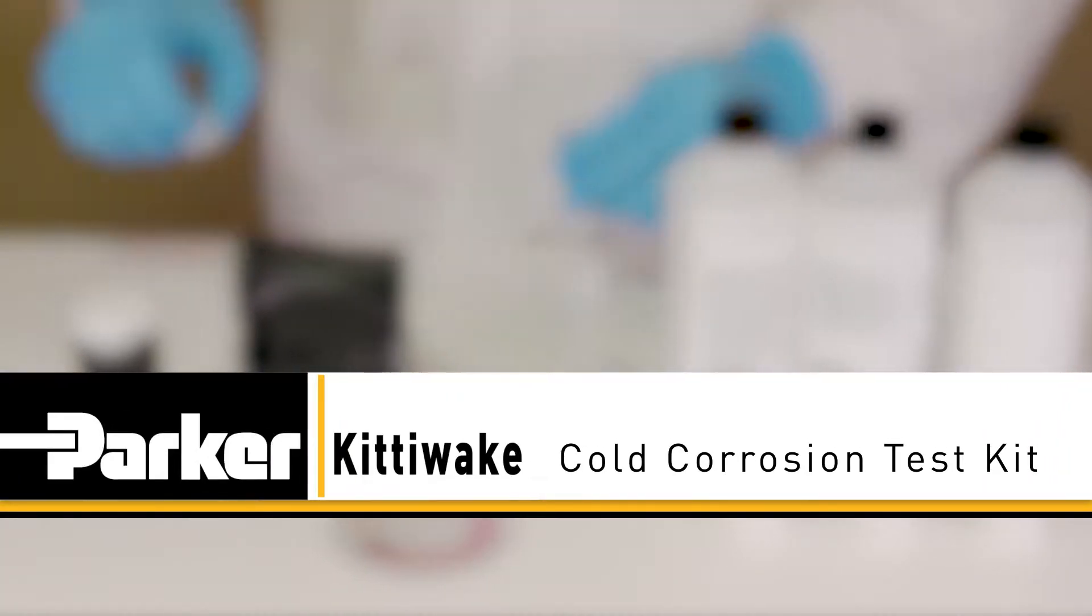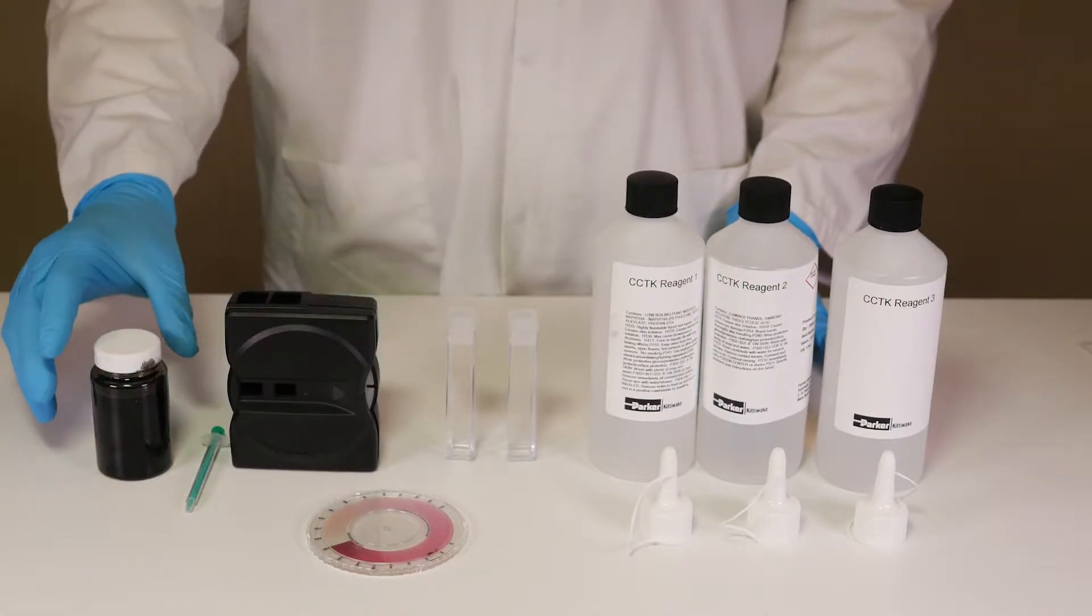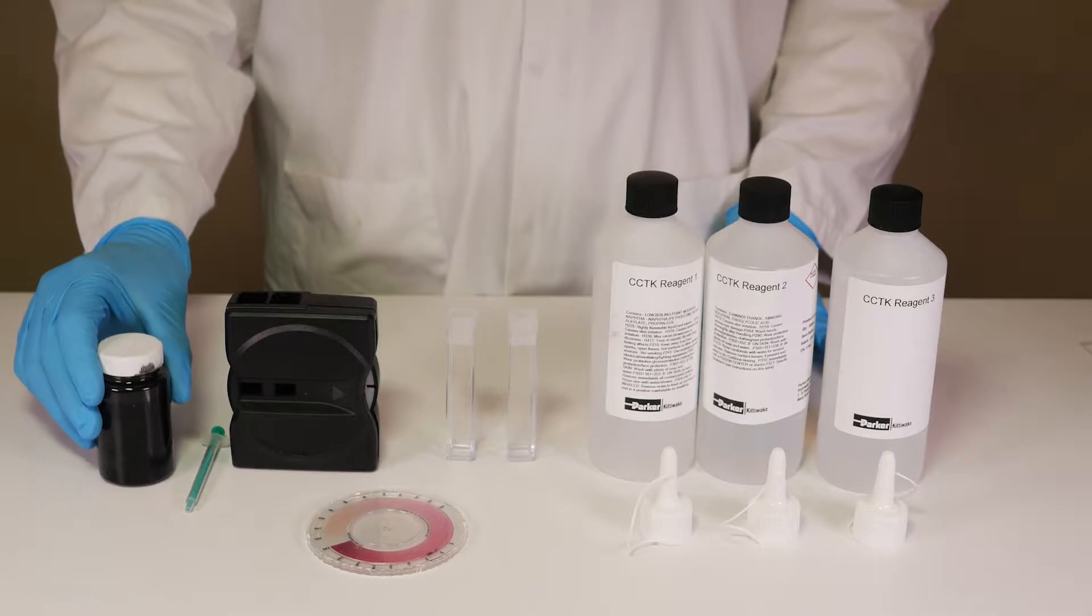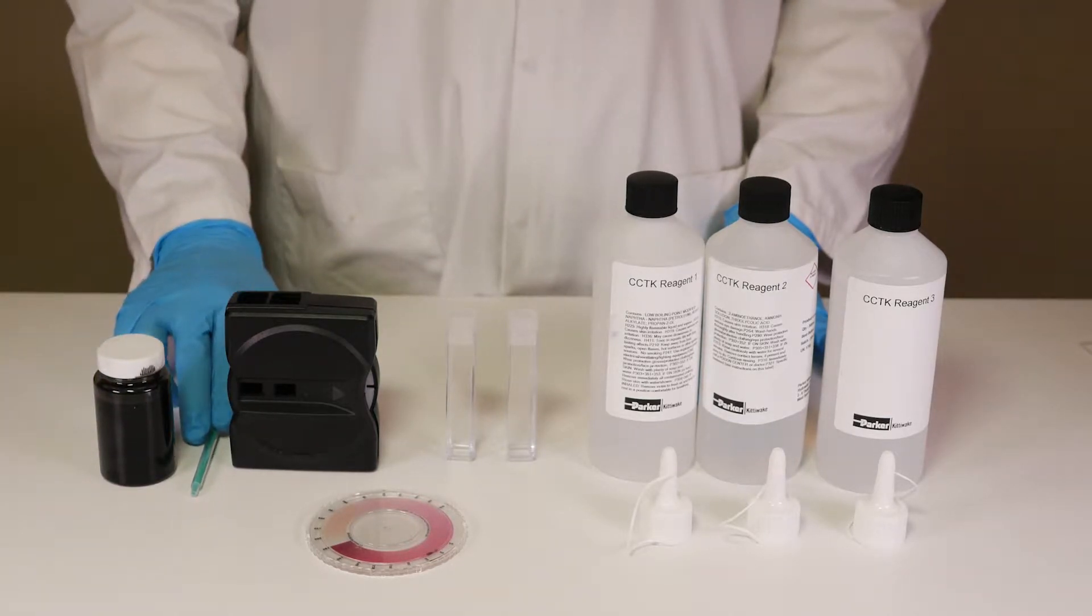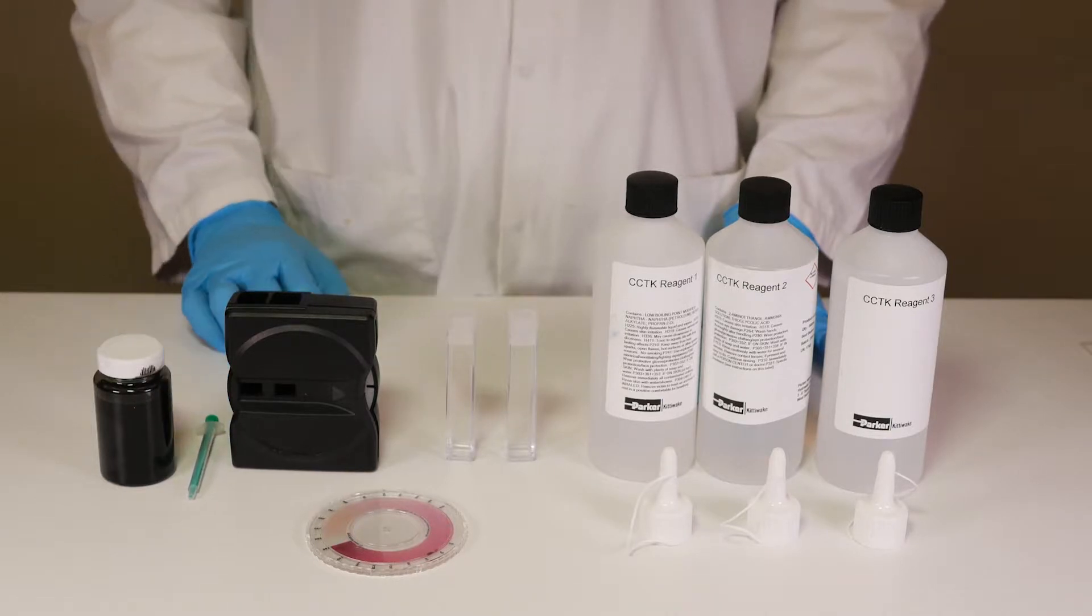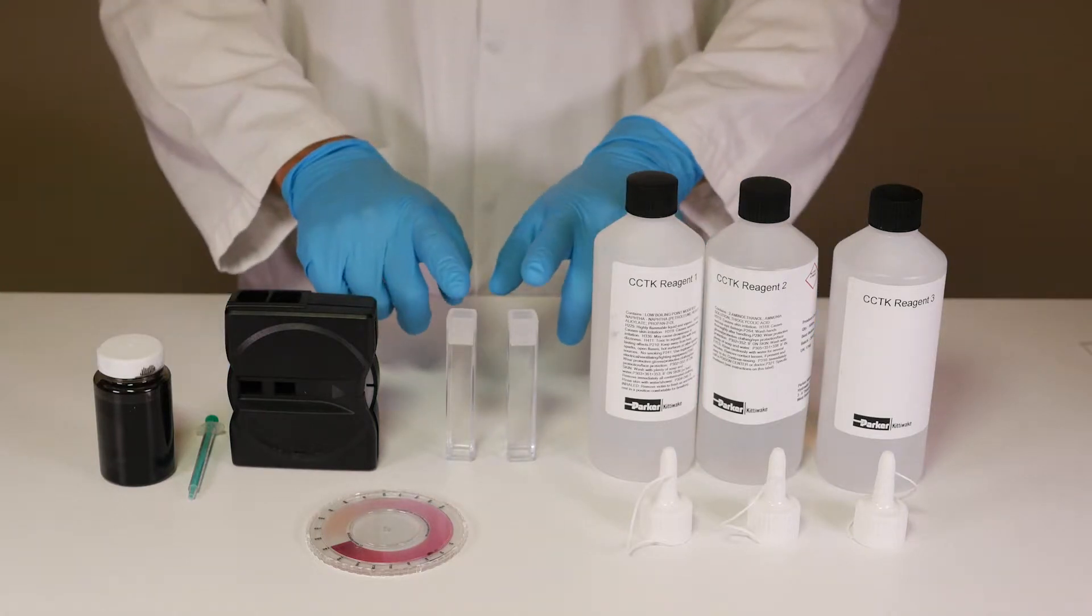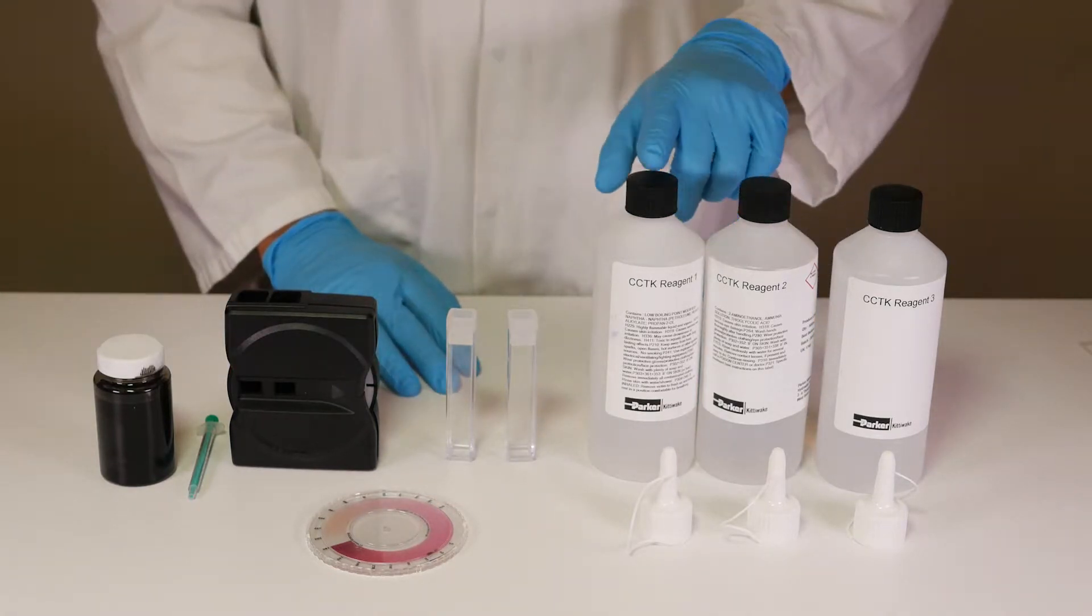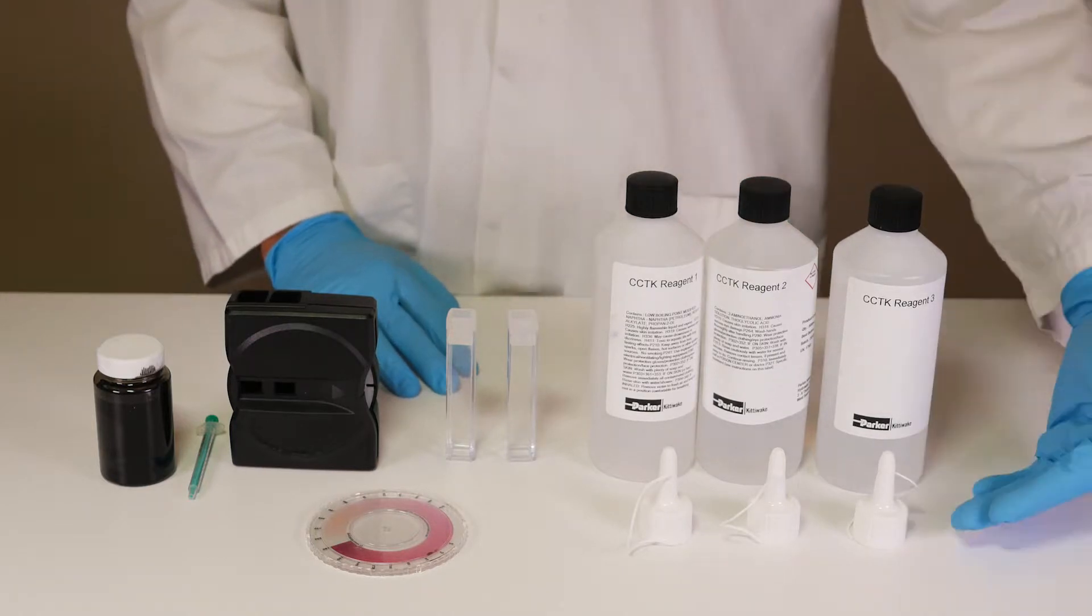To perform a Parker Kittiway cold corrosion test you will require the following: a sample of your cylinder scraped down oil, a one milliliter syringe, a comparator and colour wheel, two cuvettes, and reagents one, two and three with a pouring lid for each.